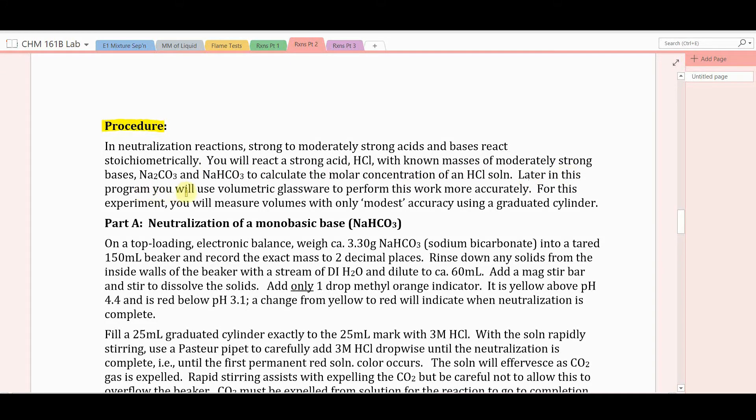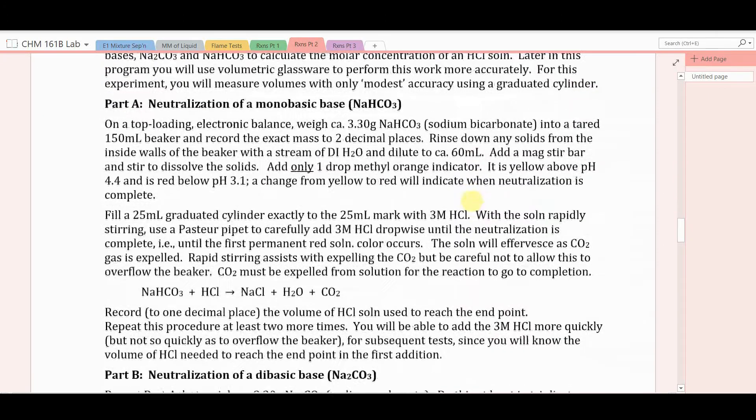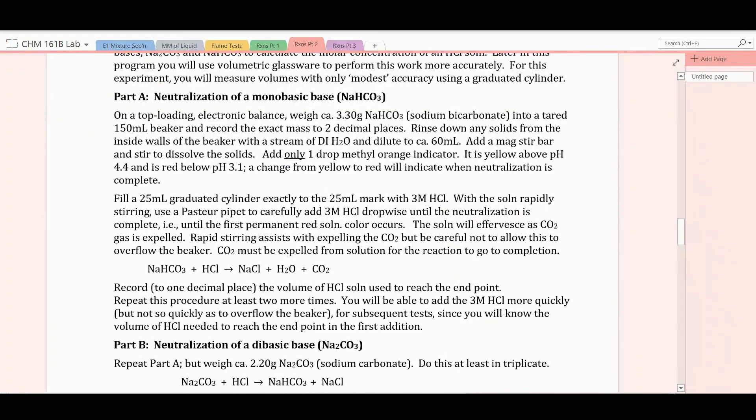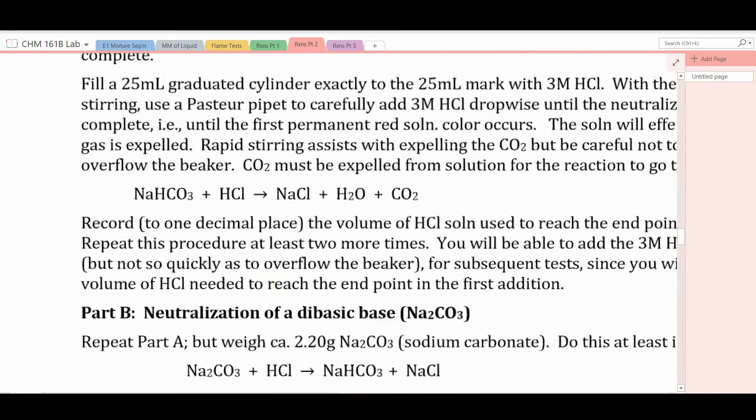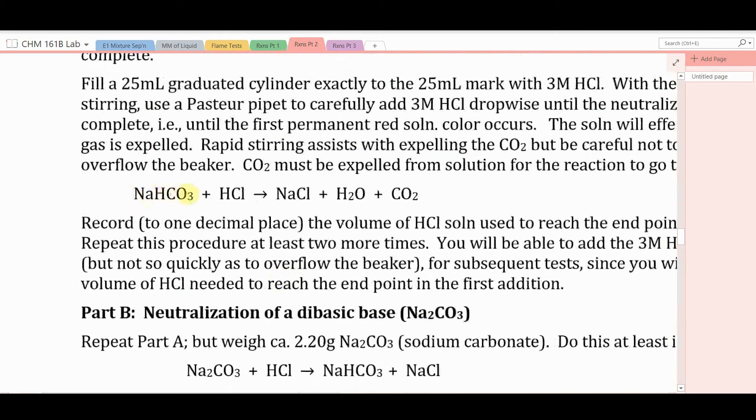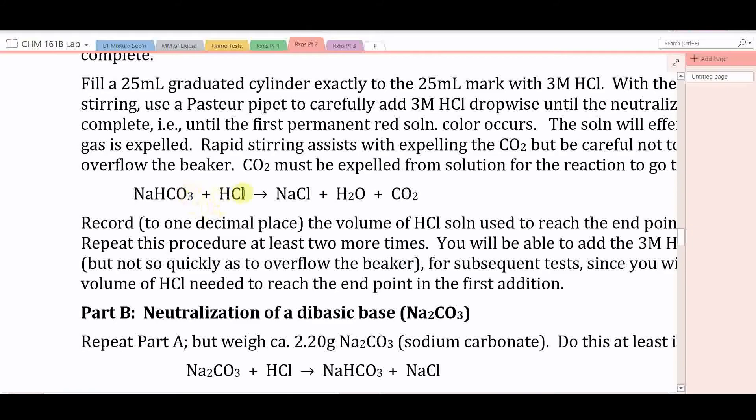Now later in this program, you'll be using volumetric glassware to perform this work more accurately. But for this experiment, we will measure volumes with only modest accuracy using a graduated cylinder. Now I'll give you details of the procedure as I demonstrate it. But let me just explain to you the reaction equations here. In part A, you'll be neutralizing a monobasic base, sodium bicarbonate, with HCl. And here's the reaction equation. Sodium bicarbonate, one mole, reacts with one mole of HCl, producing sodium chloride, water, and carbon dioxide.